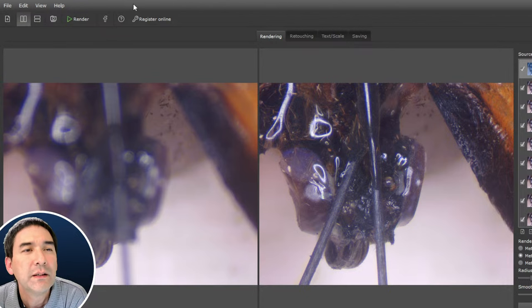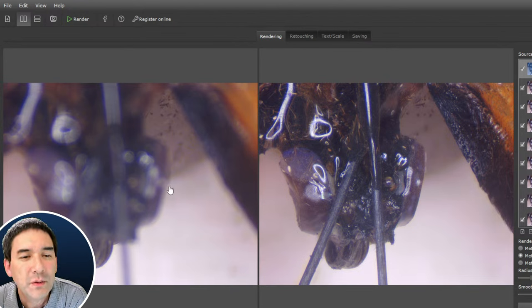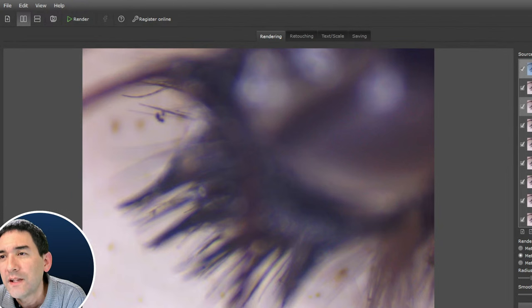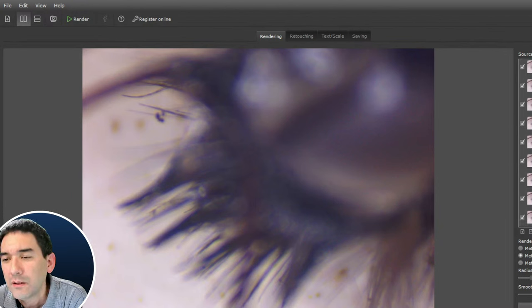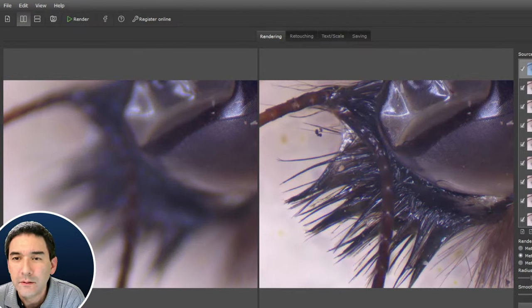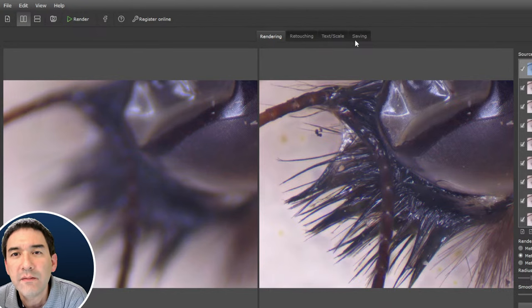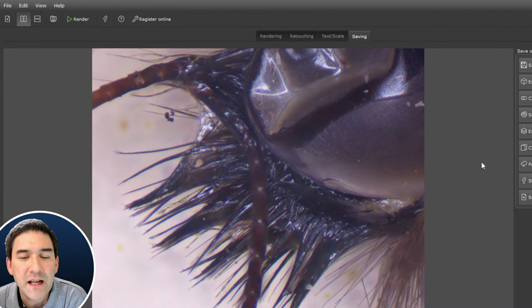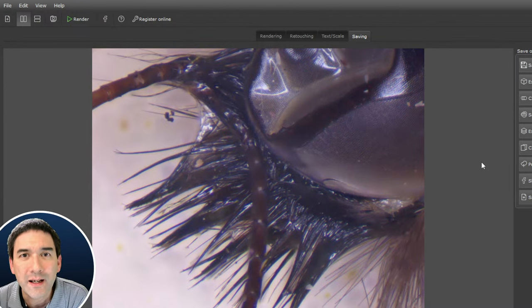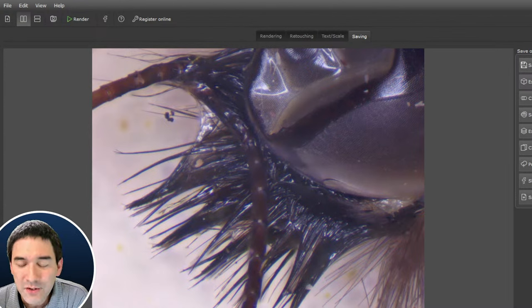It looks like it generated 116 frames. Let's click Render. Okay — it worked! Helicon Focus processed the video and produced a stack. So instead of taking individual pictures, you just focus all the way through while recording, import that one file, and it extracts the individual frames and stacks everything. That's kind of what I wanted to show you.